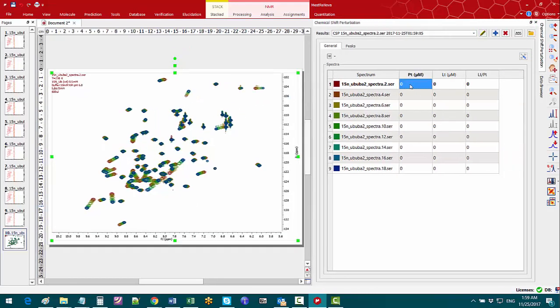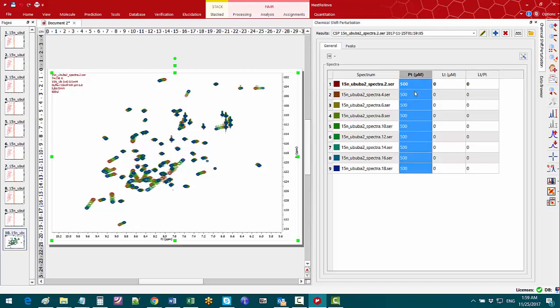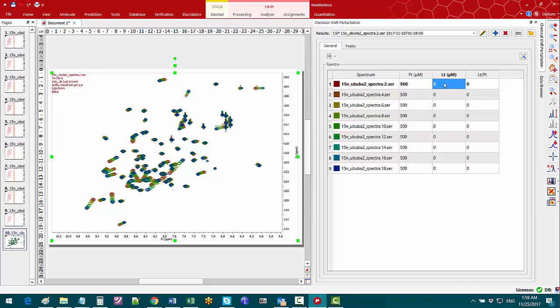In the protein concentration column I will enter 500 micromolar for all of them. In the ligand concentration column I will enter the ligand concentrations one by one.